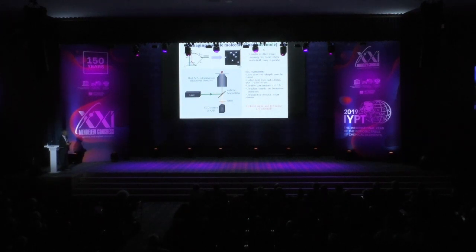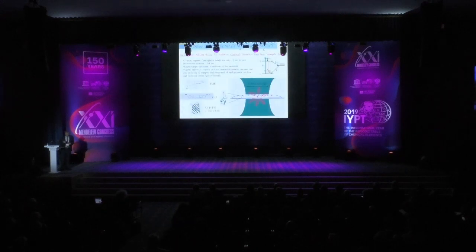So, thinking about this from a slightly different way, let's look here at the picture on the right, and you see most often, maybe you want to study a protein that's not fluorescent. Then what we will do is you'll attach a small fluorescent dye to that molecule, and then it's going to be the light from that fluorescent label that you're going to be detecting. So these labels are rhodamine dyes, cyanine dyes, other good emissive dyes, fluorescent proteins like green fluorescent protein, even antenna proteins from photosynthesis.